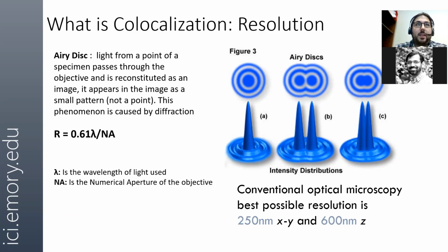There are more intricate techniques, such as STED, some of you may have heard, that are able to get even smaller resolutions. But we won't talk about those today. Rather, we'll just limit ourselves to conventional optical microscopes with a maximum of, say, 250 nanometer resolution.